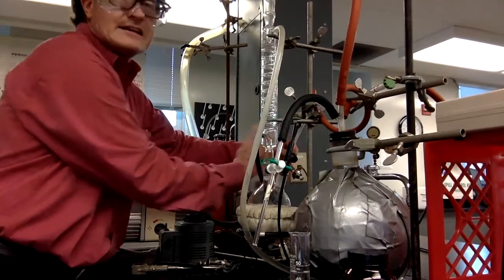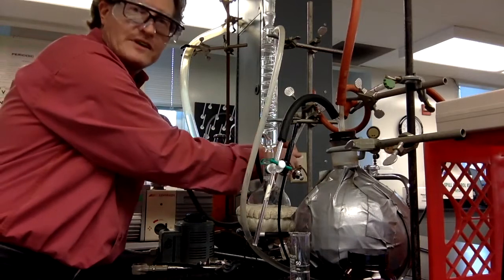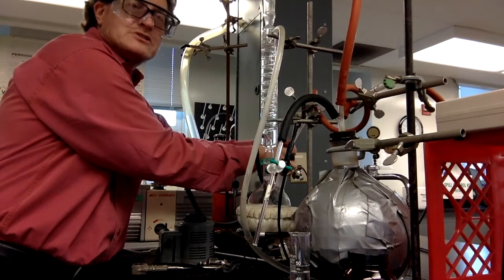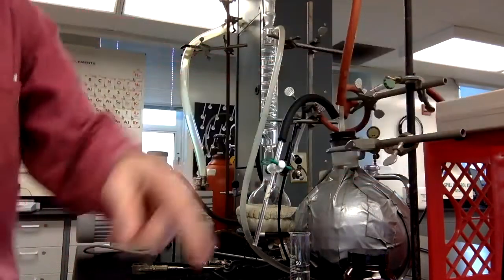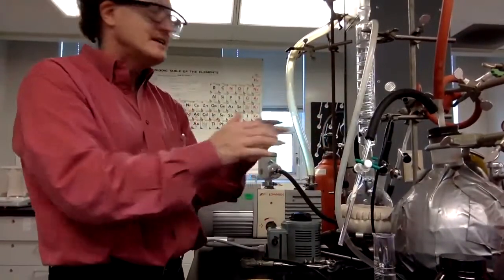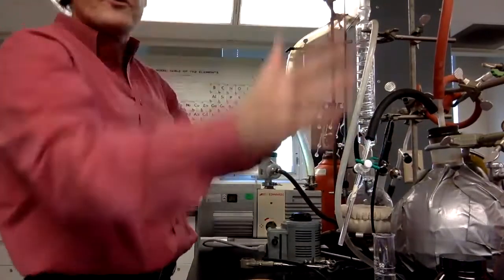close it off. Again, I experienced that backlash, right, that when I first start to turn it, it goes up and up, and then you feel it catch. And then you close that all the way down, boom, and it stops. And then we take a look at the pressure here. The pressure is not shooting up. Good, the pressure is not shooting up. We don't have any leaks in here. Excellent, okay? So now what we want to do is we confirm that our vacuum system is actually a vacuum system.